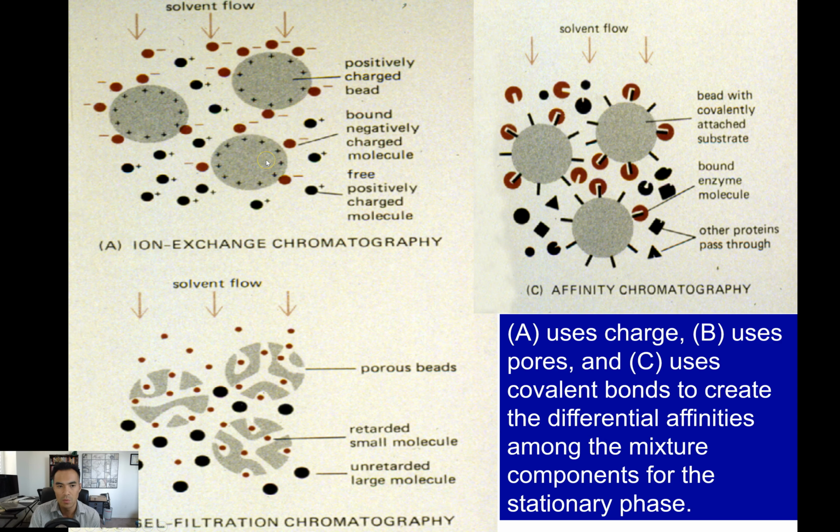Now, it doesn't have to be water. It could be something that has both a positive and a negative charge, for example, something like sodium. So if I add a positively charged bead in there, it's going to get attracted to that. That's what I call the ionic charge forces that are being attracted.